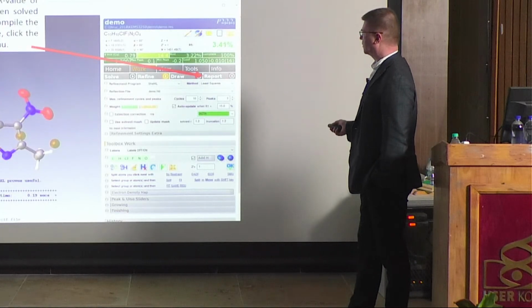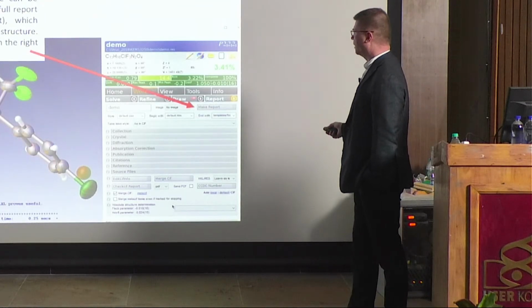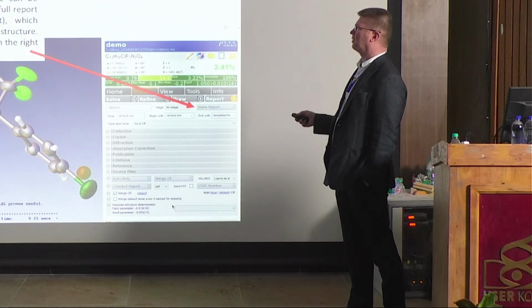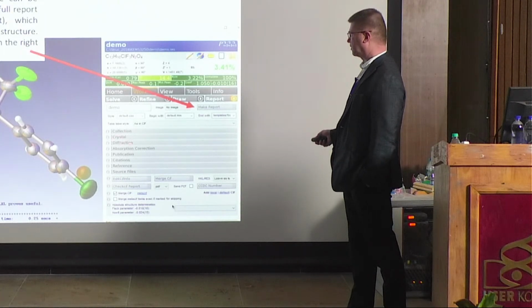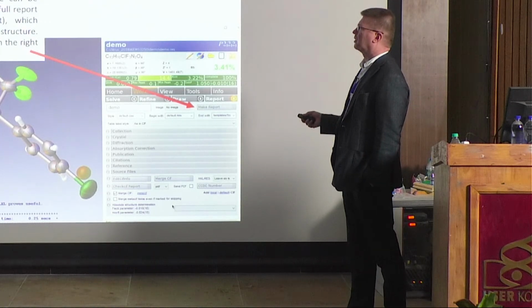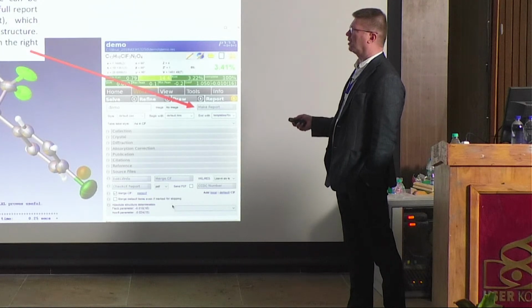Within this frame, there is a very simple and easy procedure to do this, because there is now a report. When you tick the report, it will open up a submenu here, and each of the individual abstract structures you look into. You can see here collection, crystal, diffraction, absorption, publication, and so on. There's a lot of info here. But because it's a new structure, some of this is, of course, blank. We don't know it. But the point is that we want to have a full report out of it, which will be in an HTML format.